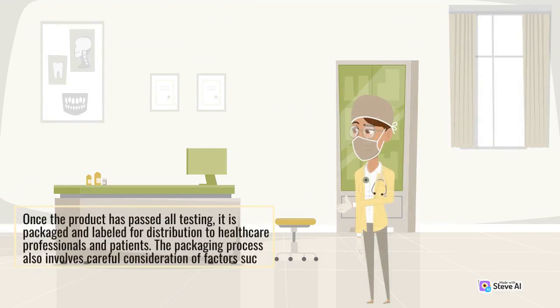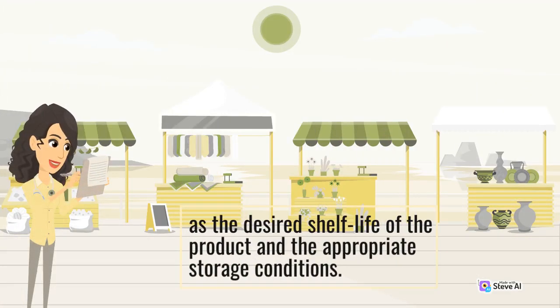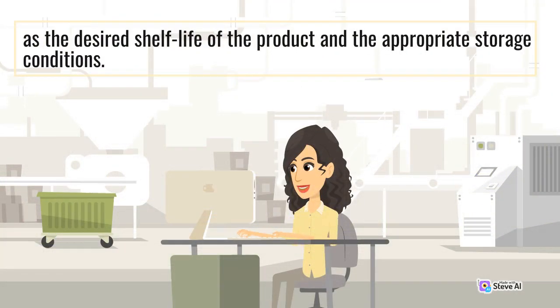Once the product has passed all testing, it is packaged and labeled for distribution to healthcare professionals and patients. The packaging process also involves careful consideration of factors such as the desired shelf life of the product and the appropriate storage conditions.